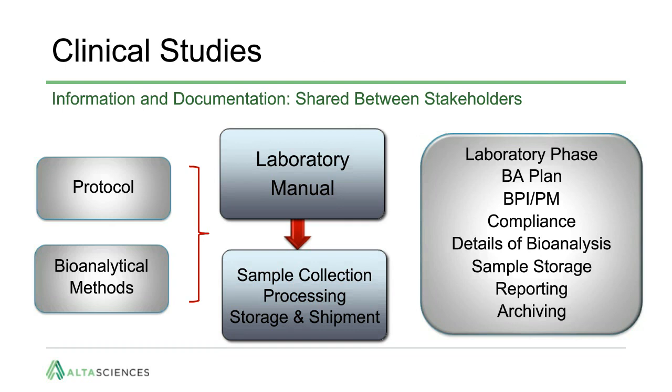Clinical protocols are sparse regarding bioanalysis details. The bioanalytical methods in alignment with the protocol need to be determined. The information on sample collection, processing, and storage and shipment is often included in the laboratory manual or similar document. The bioanalysis details are included in laboratory phase plans or bioplans, which include the assigned scientist, the details of the bioanalysis, the methods and the validation references, sample storage at the laboratory, and references to reporting and archiving.